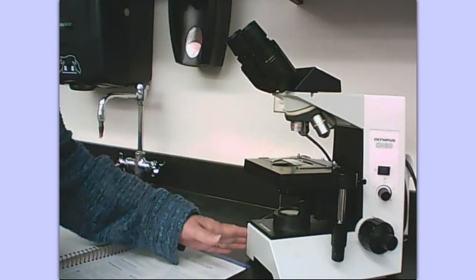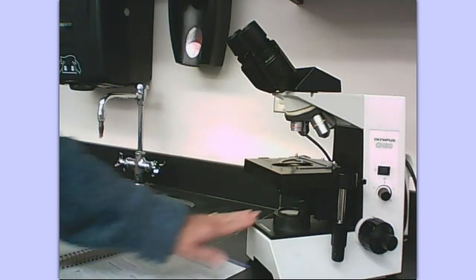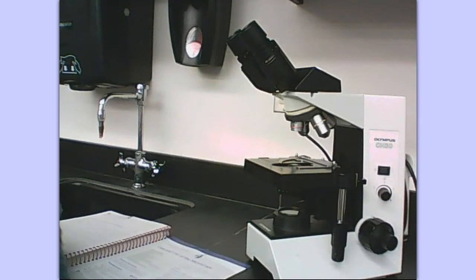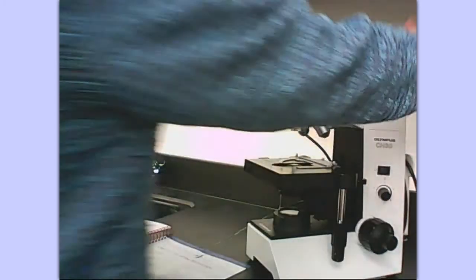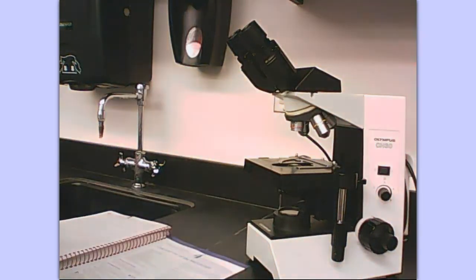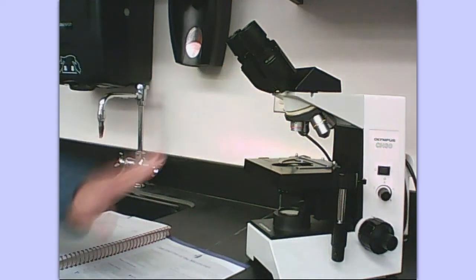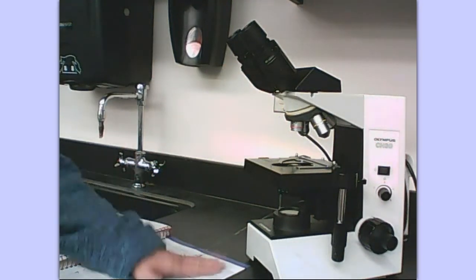I already have a microscope sitting here and I already have a slide on the stage. I got this microscope out of the microscope cabinet in the back of the room. There's a proper way to carry a microscope and it's always with two hands. There is a handle on the back where one hand goes and the other hand goes under the base. The cord should be wrapped around the back, and I unwrapped the cord and plugged it in after I set it down.